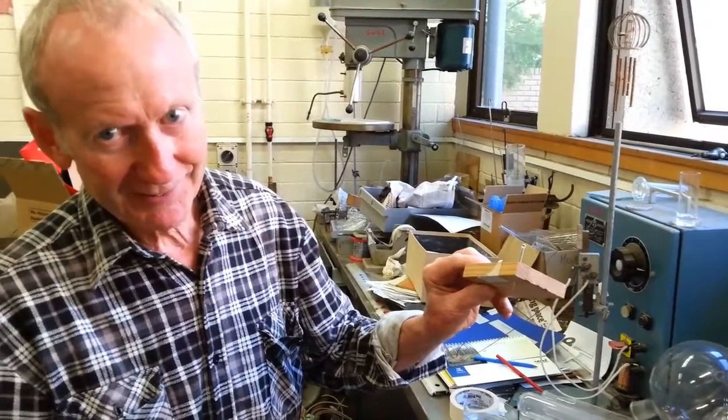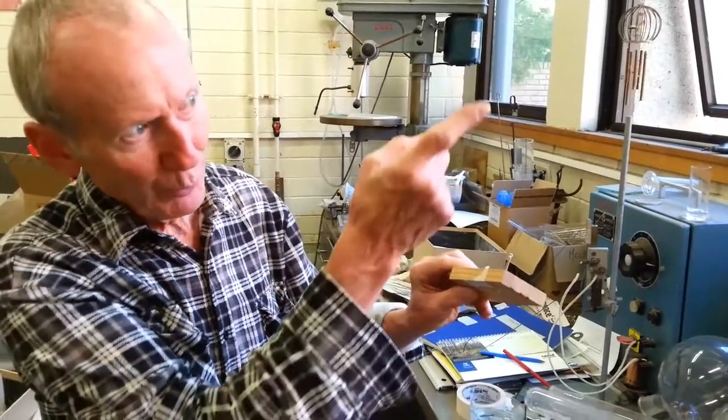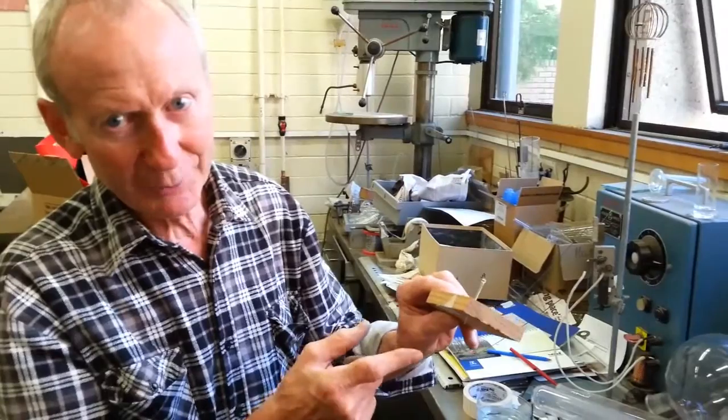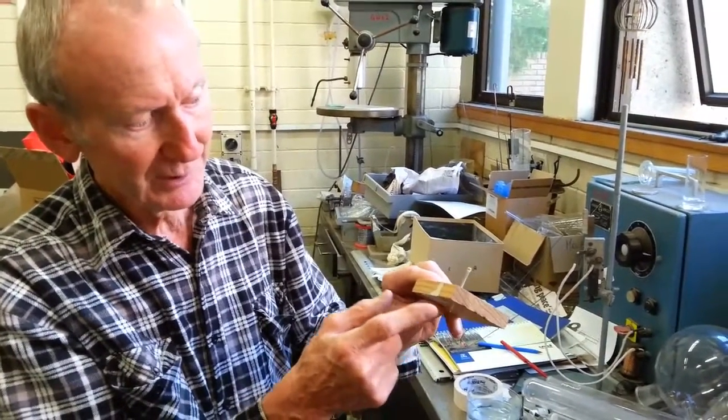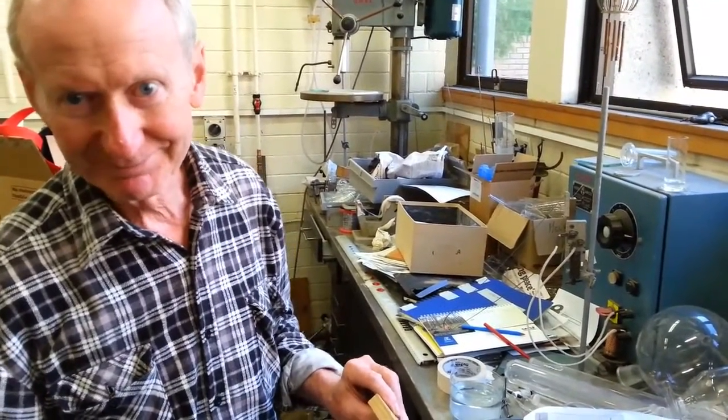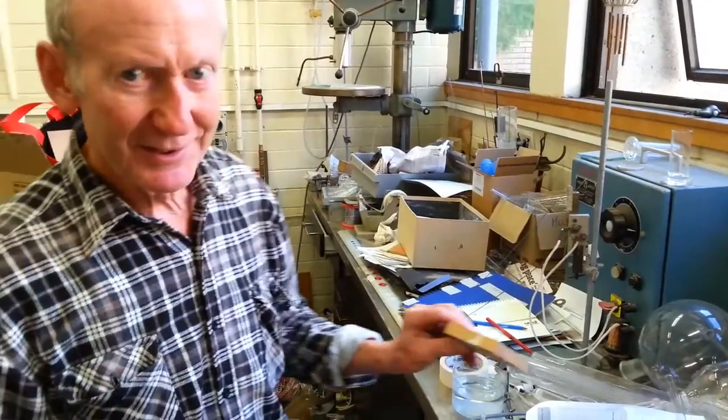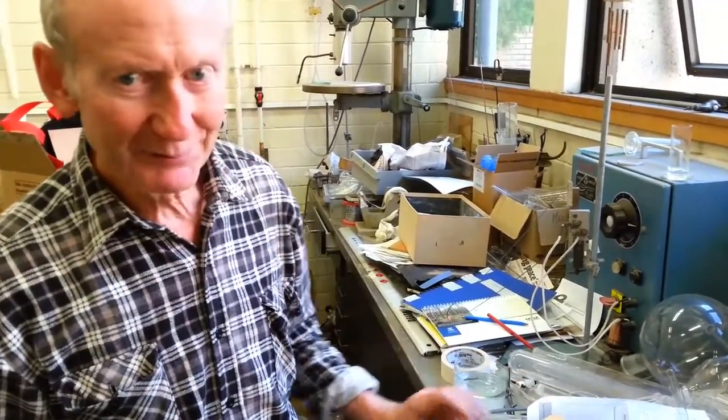Now they used to make pipettes using the same process, using window glass and toughening the window glass pipette tip for this process. And you could bounce your pipette on the floor and catch it. It wouldn't break. But they stopped making them. I think they weren't selling enough pipettes.